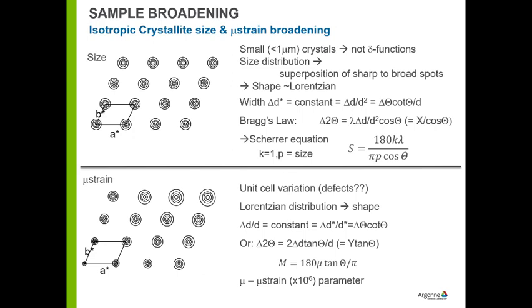Typically up in the 80 or 90, more than 80 or 90 degree range. Best would be further on than that. Now, the other thing about this is, what's the resulting shape? Well, not all crystallites have the same size. There's a range of sizes. Some are small, some are large.